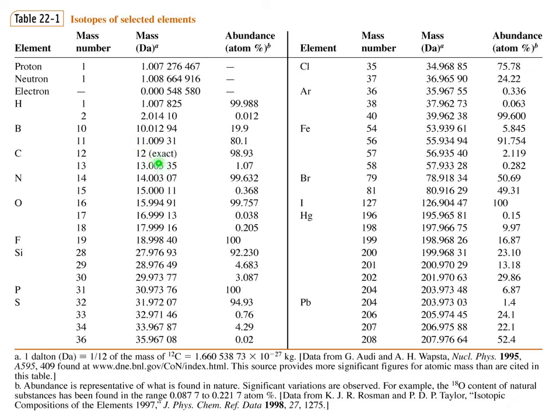We know masses of isotopes with more than 3 digits after the dot. We actually know 5, and very often we know 9 and beyond that point. We usually do not need all these numbers, but 3 are important to see the exact mass.